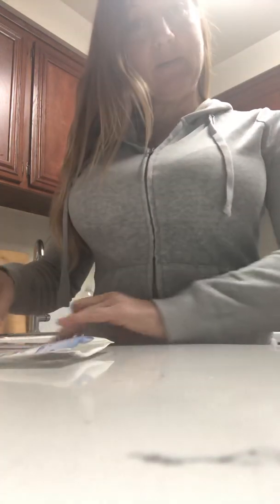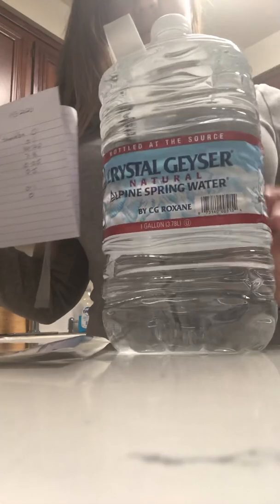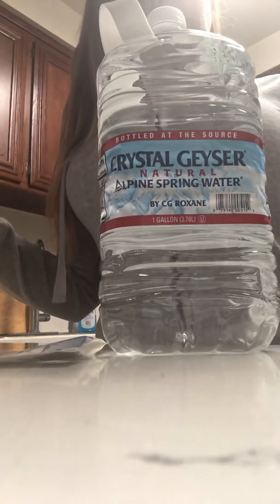Hi. So as we know, we just did the Rancho Palos Verdes water test, which totally failed for cancer-causing problems. So now we're going to test this one — the cheapest water on the block.